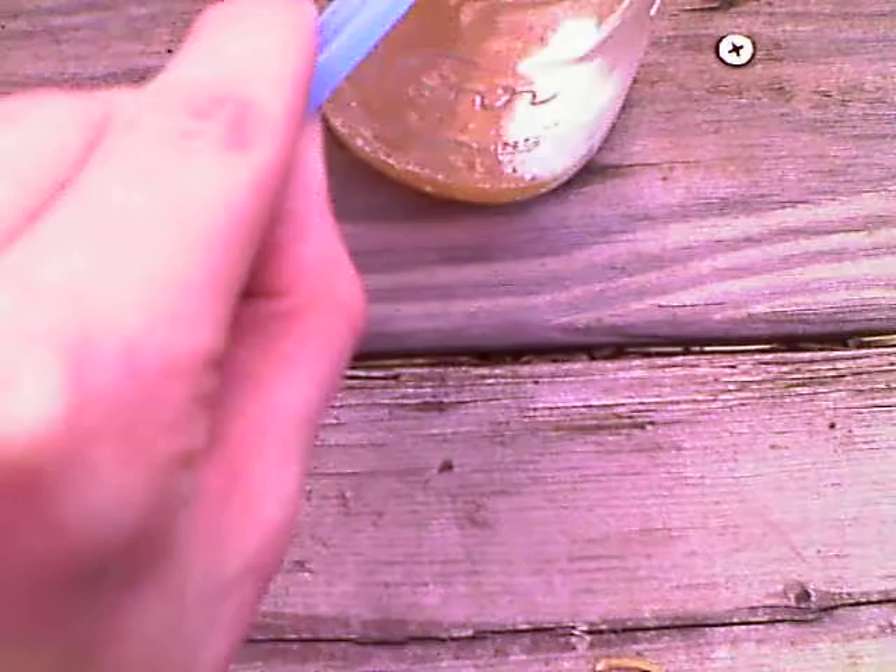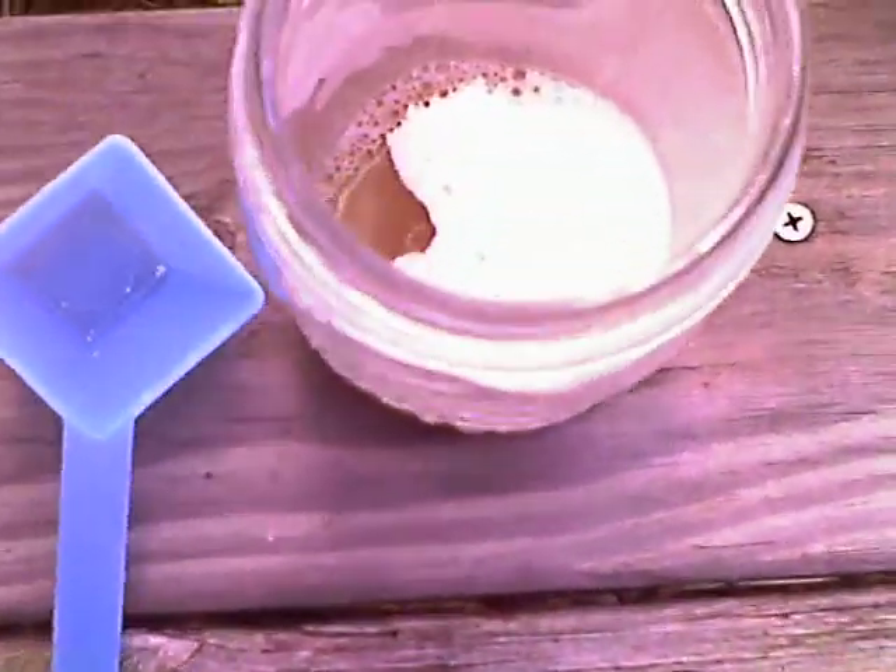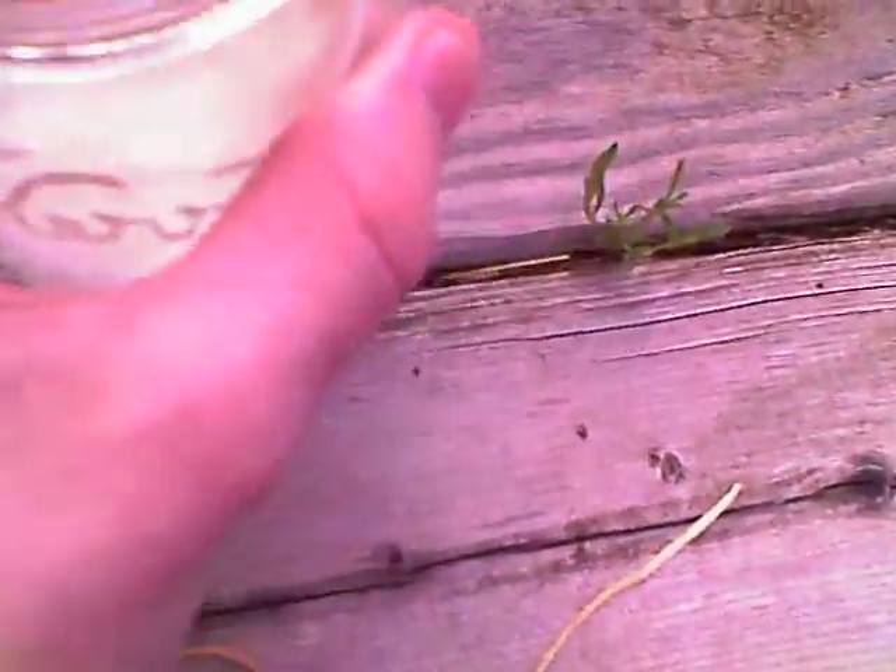Okay, so let me pour it in. It goes up a little bit, as you can see. That's the carbonate making the leftover. Well, here it goes.